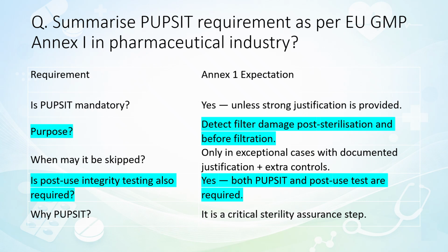Is post-use integrity testing also required? The right answer is yes. Both PUPSIT and post-use tests are required. Why PUPSIT? It is a critical sterility assurance step.